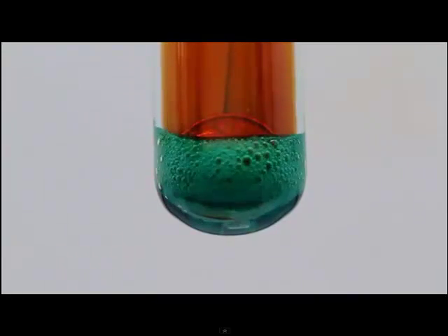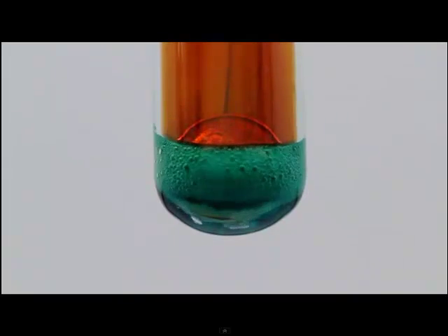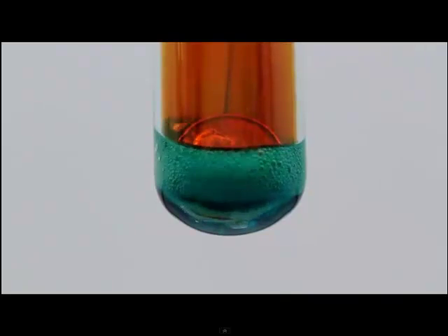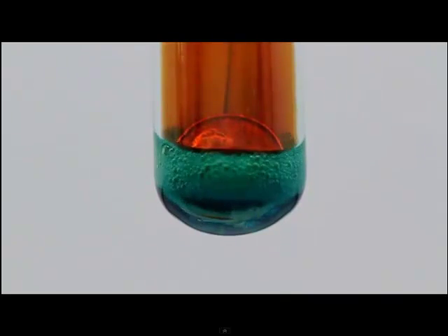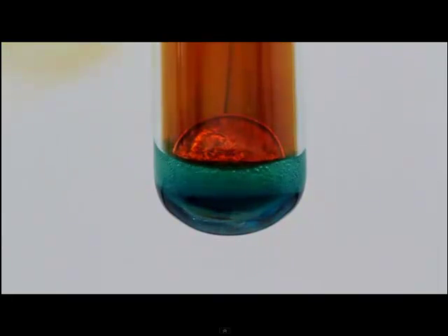From our observations in lab 17, we might be able to identify what that bluish greenish solution is. What could it be? You also see bubbles forming. What could those bubbles be? And that brown gas, we already know, is nitrogen dioxide. That's why we had to do this experiment in the hood.